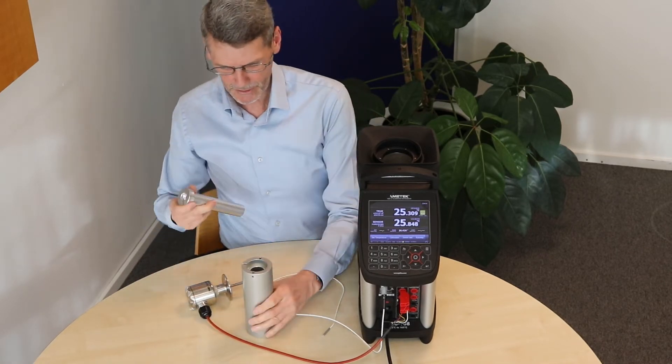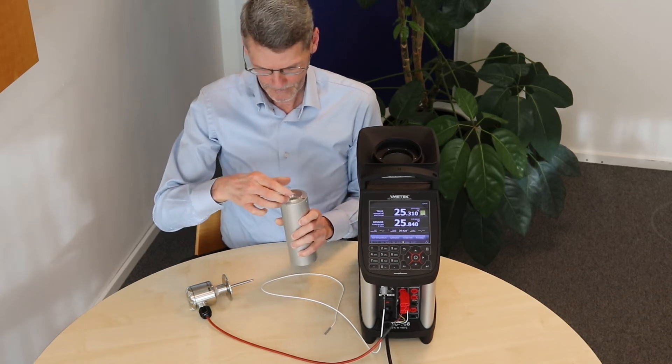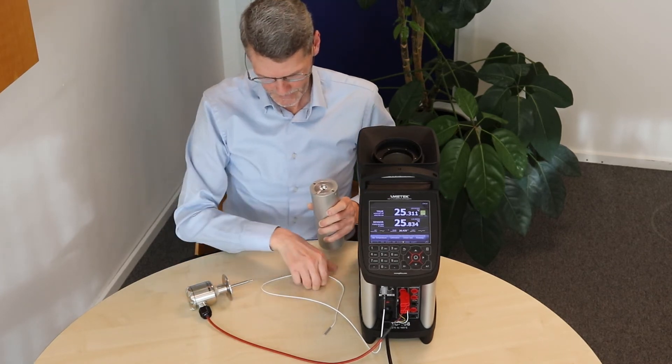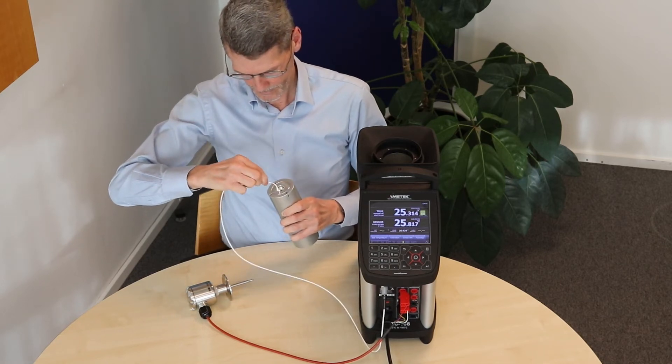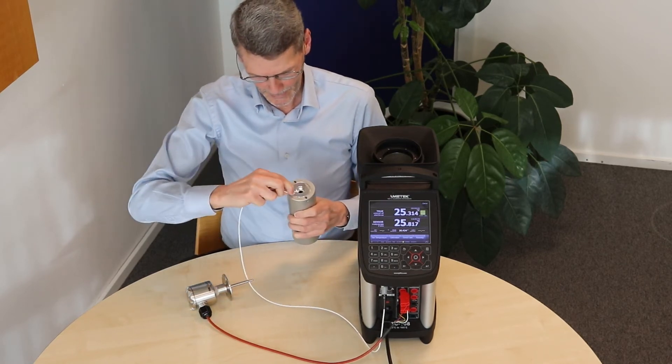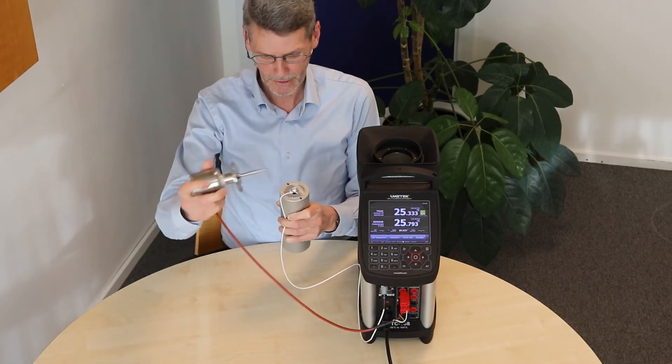And this clamp sensor is fitting directly into a special adapter. Like this. And then you can mount your reference sensor, in the same depth as the sensor that you are going to test.